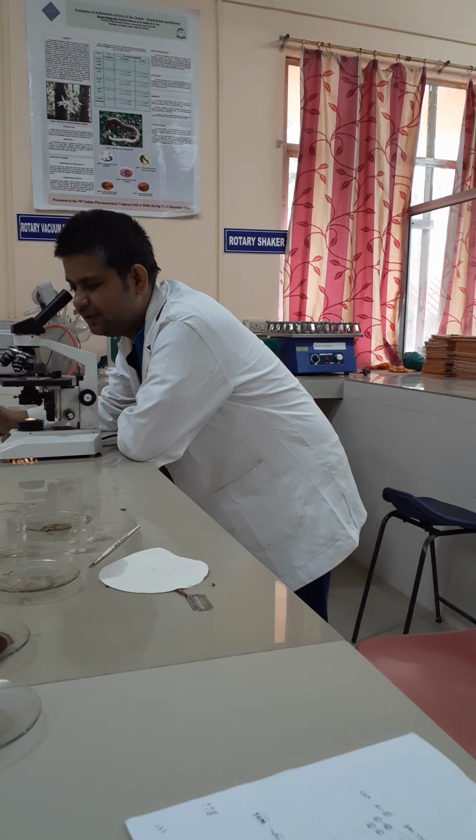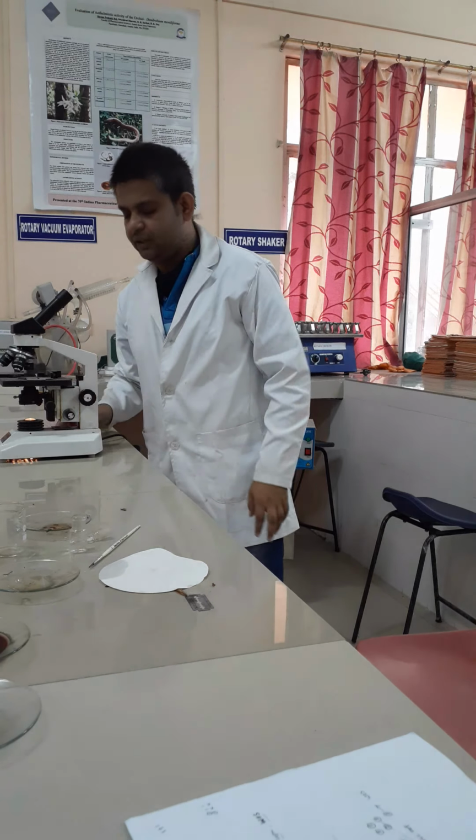Below that is the cortex region. In the cortex region, you will mainly find 2 to 3 rows of medullary ray cells. So these are the few important characteristic features of Cinchona bark that you can observe under the microscope. Mainly you will find cork, followed by the pericyclic fibers, and in the cortex region you will find the 2 to 3 rows of medullary ray cells, which are very distinct in nature. These are the certain characteristic features of Cinchona bark.